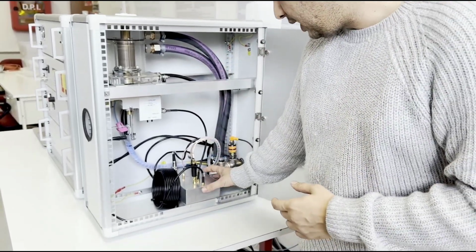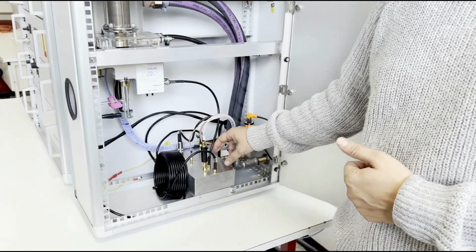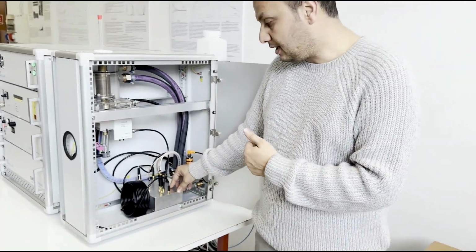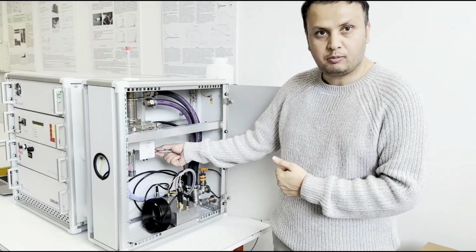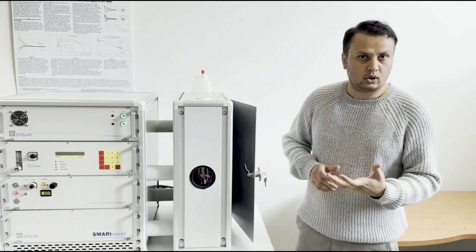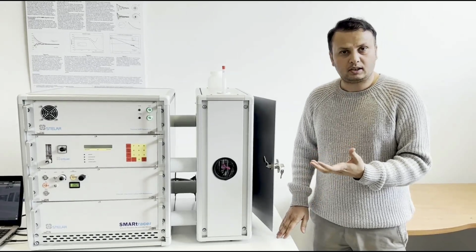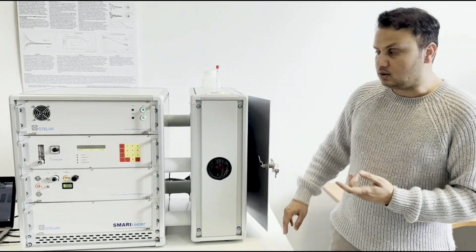And then we also have the tuning box. The tuning box is one of the important parts of this device because it contains the circuitry to tune the probe, plus it also contains the circuitry to pre-amplify the RF pulses. So with this simple instrument, with all these capabilities, you have an instrument which you can use in your labs and in your industries to perform NMR experiments on your samples and to know their relaxation values.